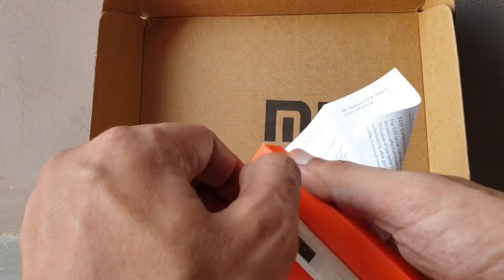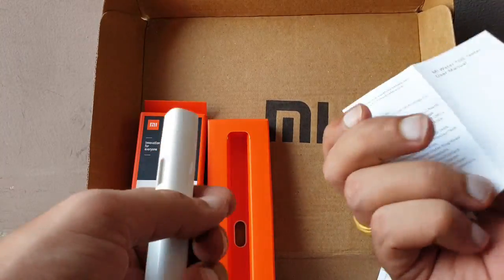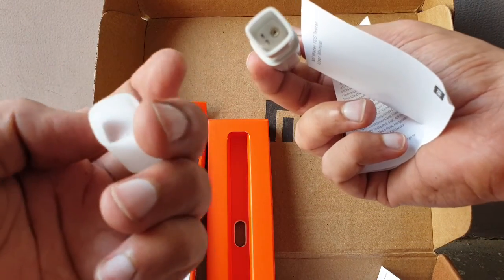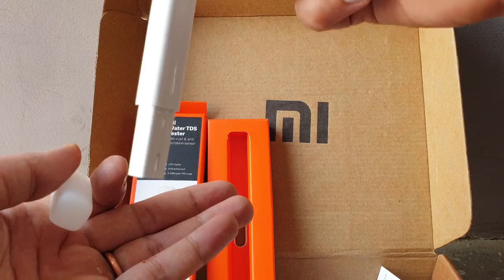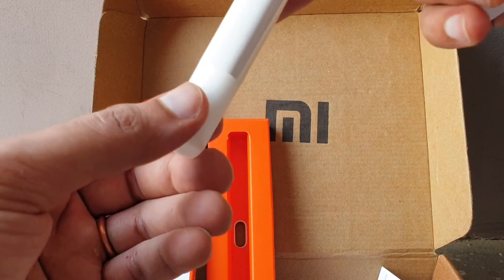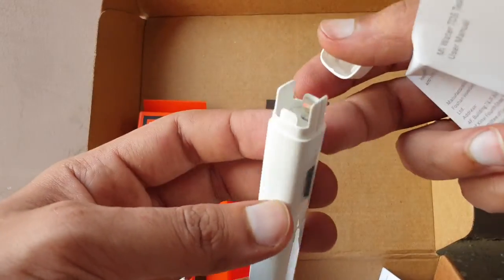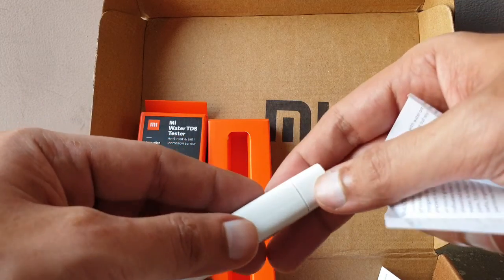The packaging is very good. This is the TDS tester — you can see the probe pins here. You can use a glass of water and dip it in, or collect a water sample in the cap, attach it to the tester, lock it, and it will tell you the TDS. The LR44 button cells go into the battery compartment here.